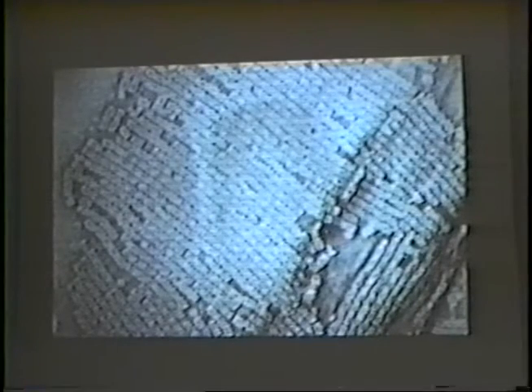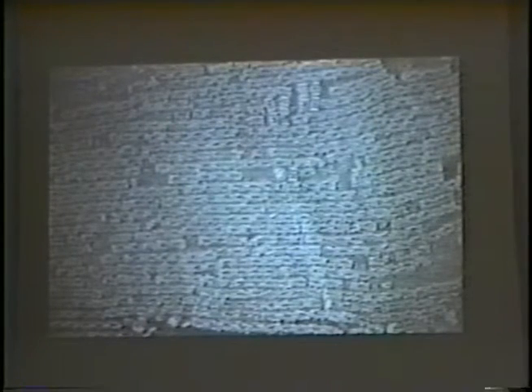An example of a more regular crystalline array, molecules end to end, producing parallel rows of molecules. Areas such as this are almost suitable for digital image analysis. And at a slightly higher magnification, the same sort of thing. Here we have a row of molecules with discontinuities, and there a couple of molecules which are orientated at 90 degrees to most of the others, obviously interfering with the regularity of the packing.